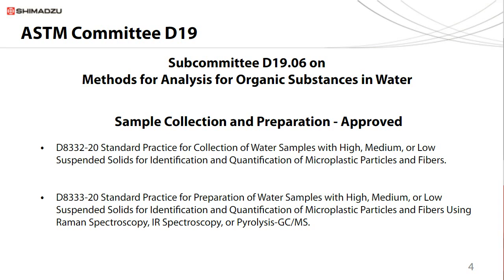There are a couple of standard practices that have been already approved, and they are related to the sample collection and sample preparation in waters with different turbidity. These documents can be used as reference for collecting and digesting or preparing samples from wastewater to drinking water and all the types of water in between.